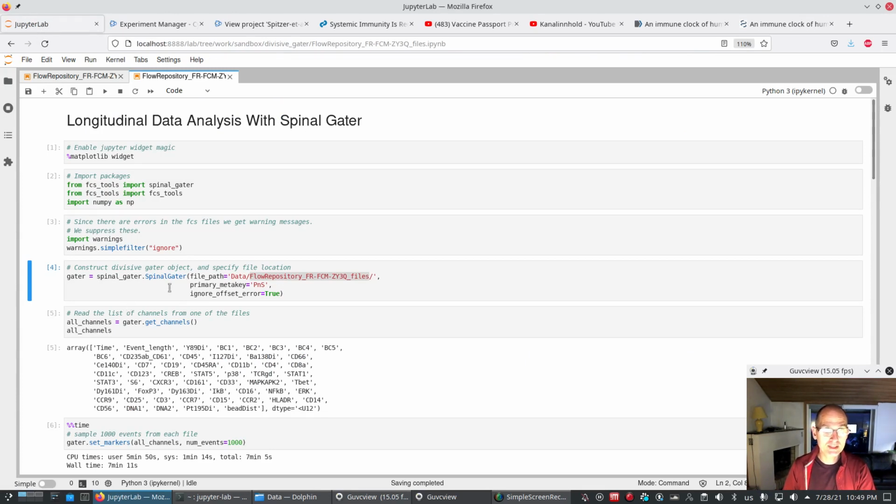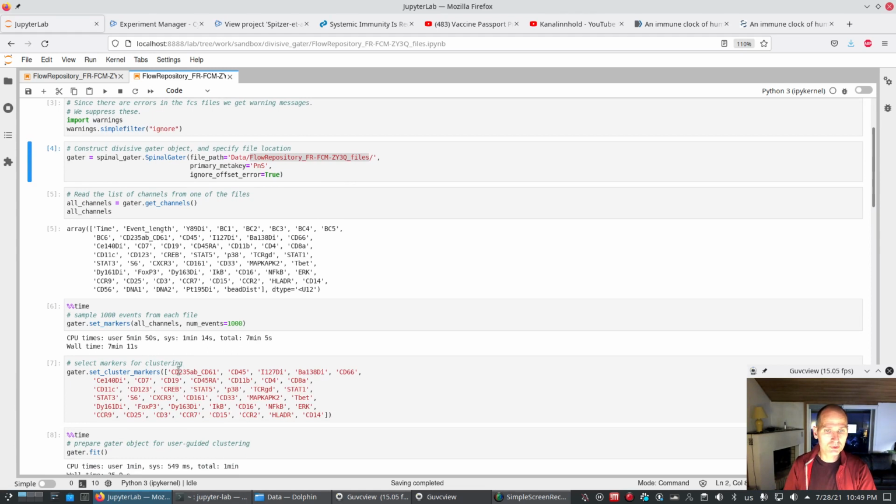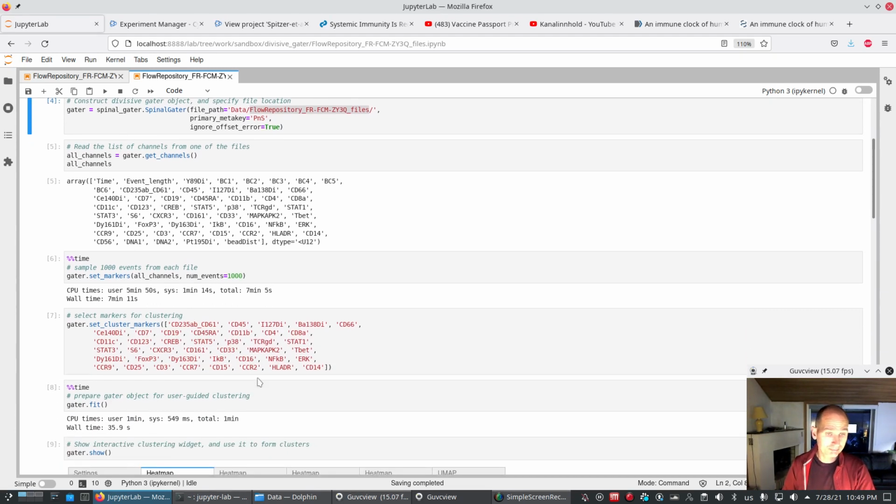We'll try to do the same thing as we did in the first video, where I was looking at data from somewhere else, from cancer. This time selecting the channels was done by me, just taking the things that look like functional and lineage markers.